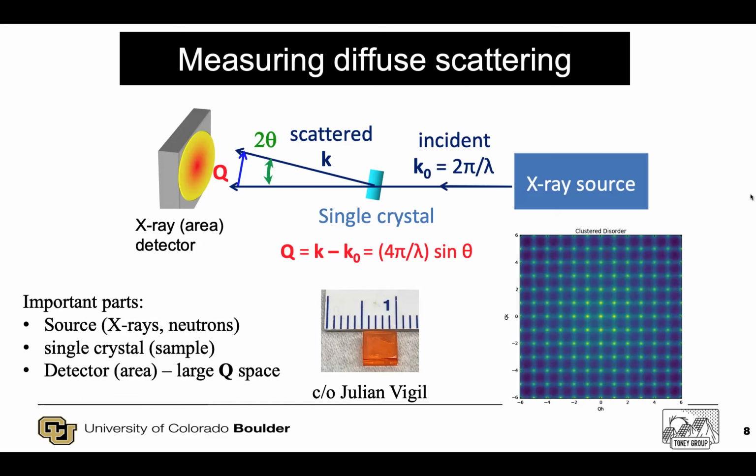I think more important than the X-ray side, over the past 10 years, is the wide, very large area detectors. And this now has enabled us to collect data on the X-ray side. What used to literally take weeks now can be done in 30 minutes from the X-ray side. Similar thing from the neutron perspective, but now it's not several hours, but this is still significant.